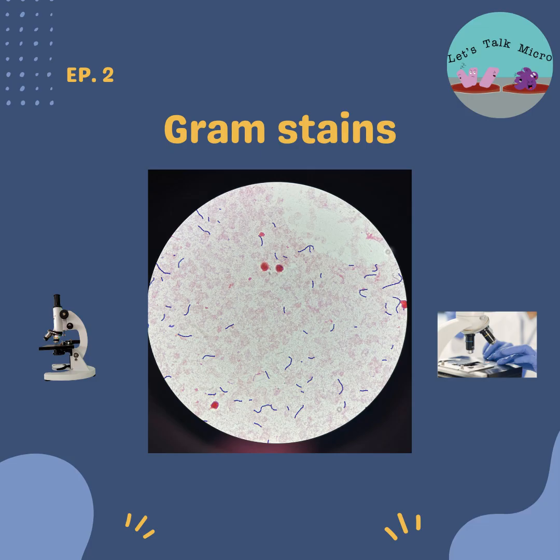So let's do a quick recap. If you have swabs, you can set up the smear two ways. You can either roll the swab on the slide, or if the swab has liquid, you can vortex it and add a drop of that liquid, the Amies media, on the slide. If you have a sputum, you can dip a swab in it and then roll that swab on the slide. If you have a bronchial wash or bronchial lavage, you take a drop of it and add that on your slide.